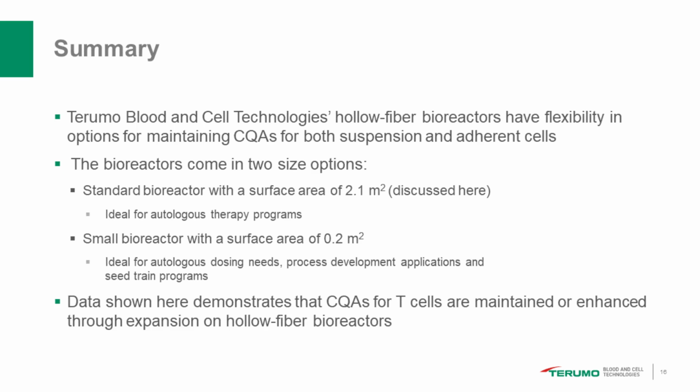We use lactate as a proxy, and so we have a mechanism of working out an estimated number of cells. Generally, what we see in the harvest is that we're within 5 to 10% of that number. And again, it's a calculated number, because we can't actually view the cells once they're on those hollow fibers. It's a very compact space for a large amount of surface area.